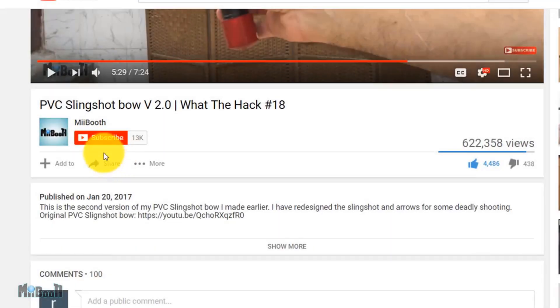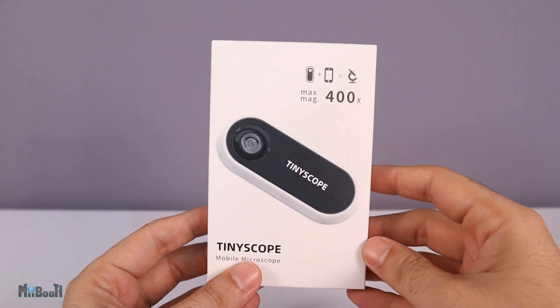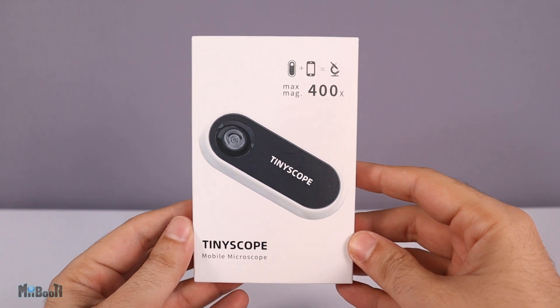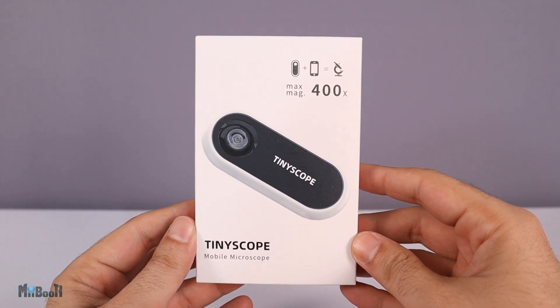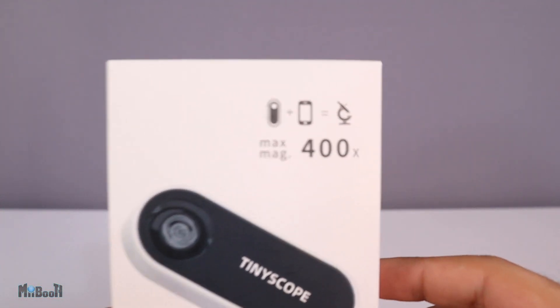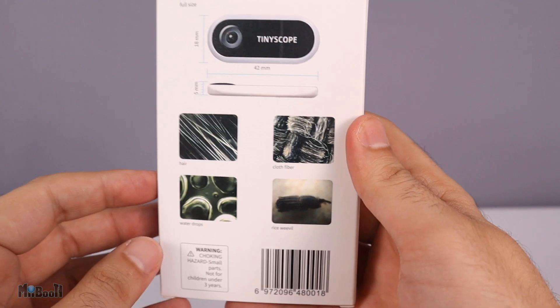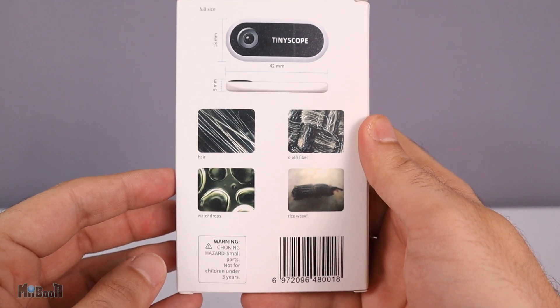If gadget reviews, DIY projects, and life hacks are your thing, consider subscribing and turning on the bell notification. Right here we have the box with an image of the microscope on it. It says TinyScope Mobile Microscope and shows the maximum magnification of 400x.